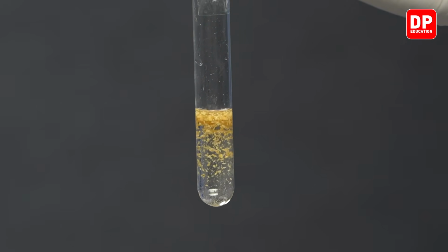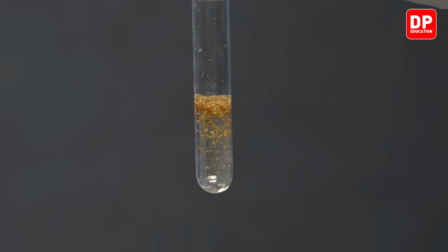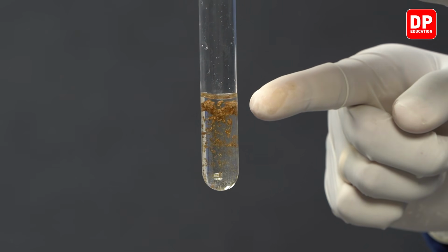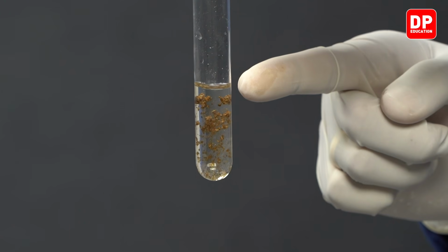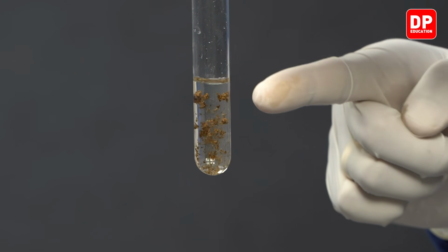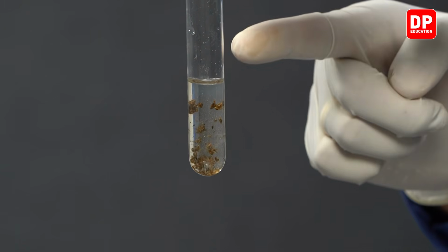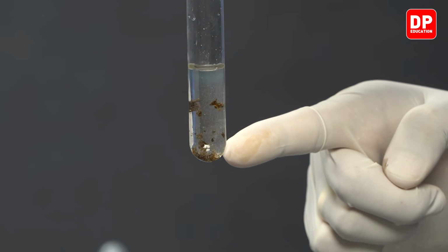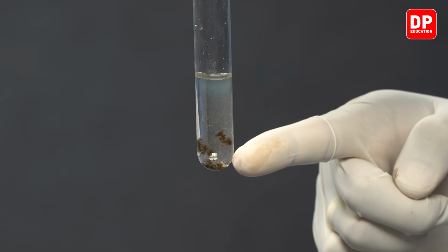Did you see, as soon as silver nitrate was added, a white color precipitate was formed, and as you can see, little by little, the white color precipitate is changing color to brown and then to black. So you can see the white color precipitate is now a black color precipitate.